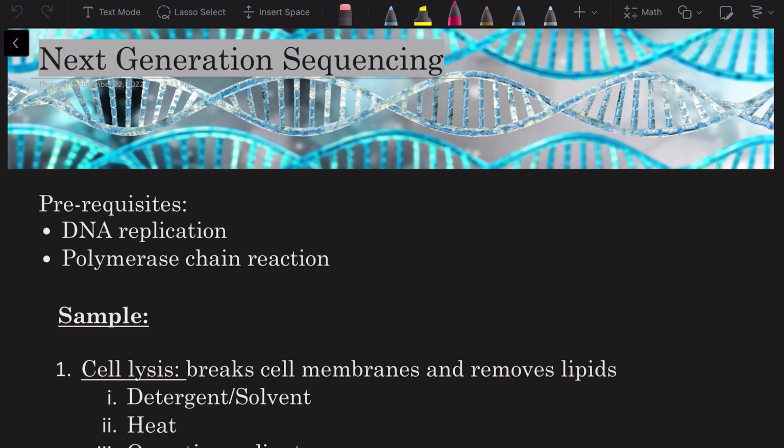So I thought, why not just make a video about next generation sequencing, just the very basics about what happens in next generation sequencing and just the basic process. So I'm not going to go into too much detail. There are a few prerequisites before we go into this lecture. You should know what DNA replication is and what the polymerase chain reaction is. So I will not go into details of those. Now let's head into next generation sequencing.